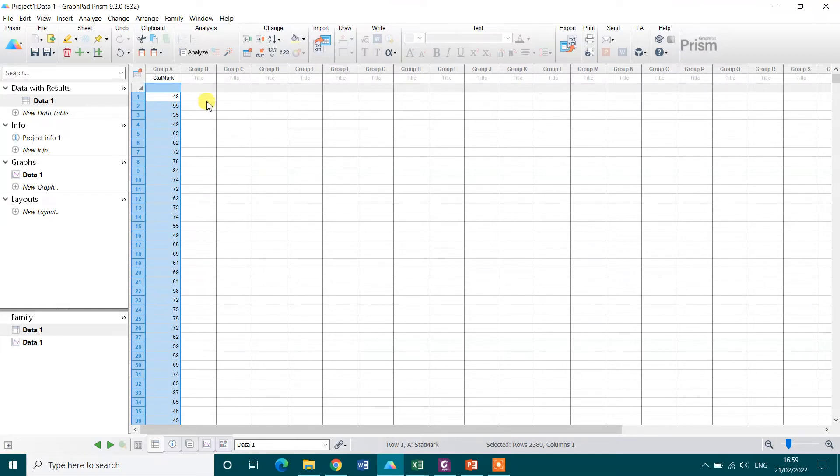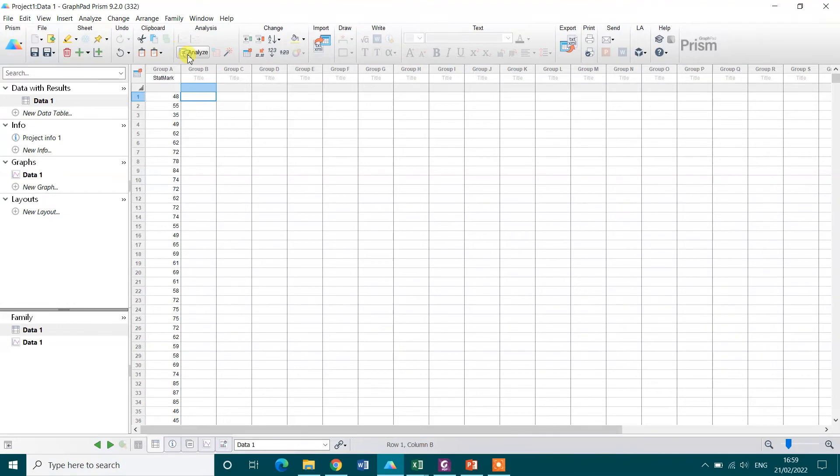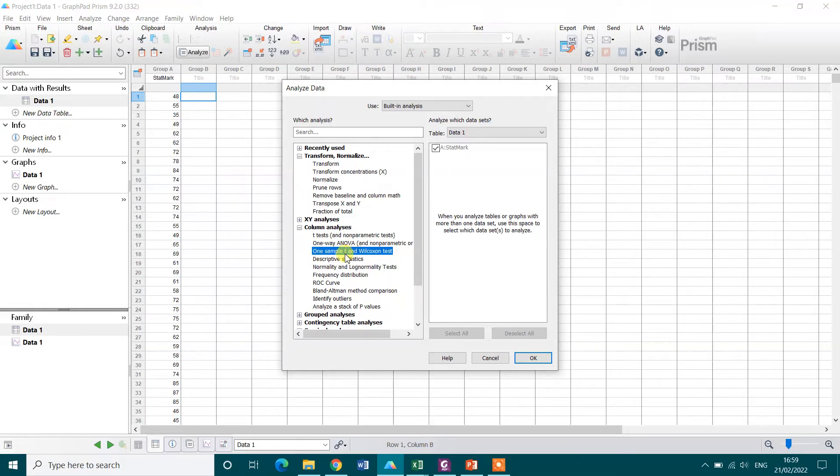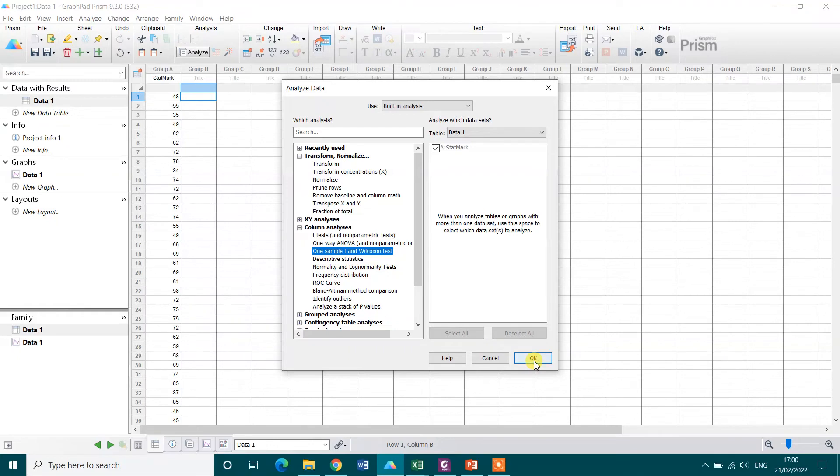Now to perform the one sample t-test, I need to click on analyze and under the column analysis option, there is option of one sample t-test. Click that one. By default this is showing the column variable, that is stat mark, and then press OK.